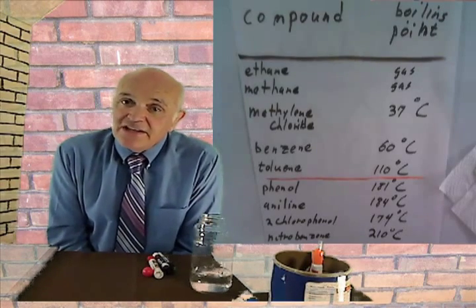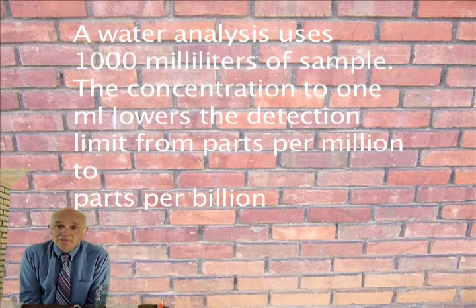I think the financial aspects are interesting. A typical 8270 costs $600. You want to have an 8270 run on your garden soil, not a problem, but it'll cost you $600. It's negotiable, but it's kind of a big bucks deal.